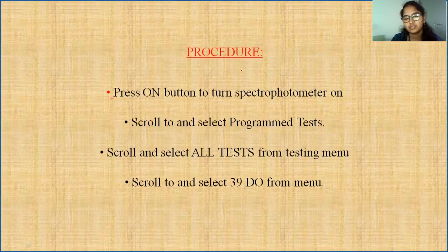Insert the tube into the chamber, close the lid and select scan blank. Fill a second tube to the 10 ml line with a treated fixed sample. This tube is the sample. Remove the blank from the spectrophotometer, insert the sample tube into the chamber, close the lid, select scan sample, and record the result.